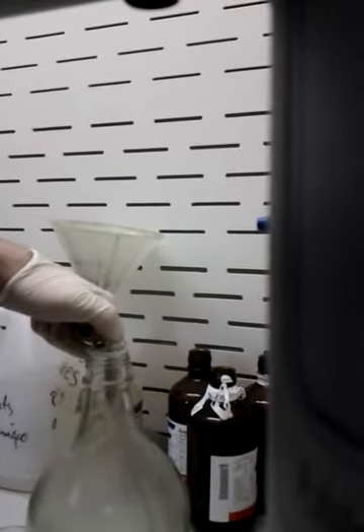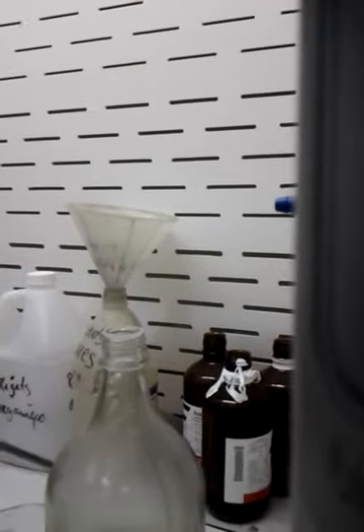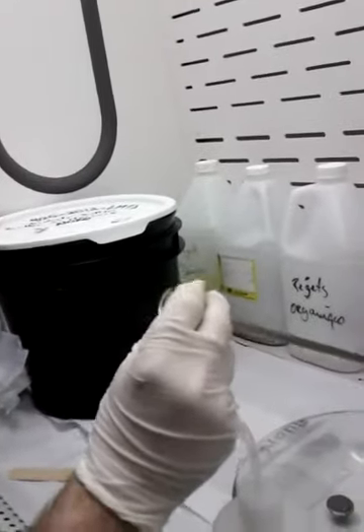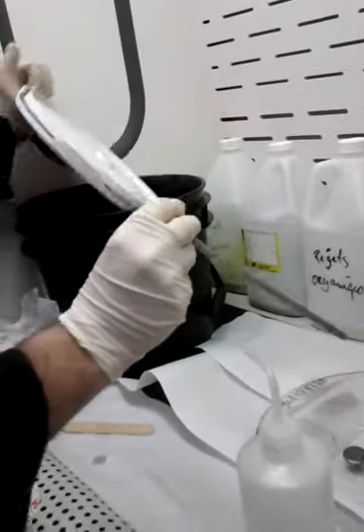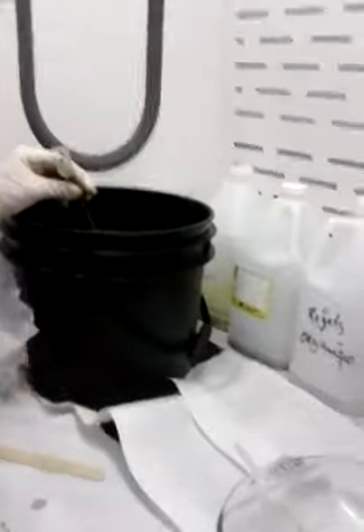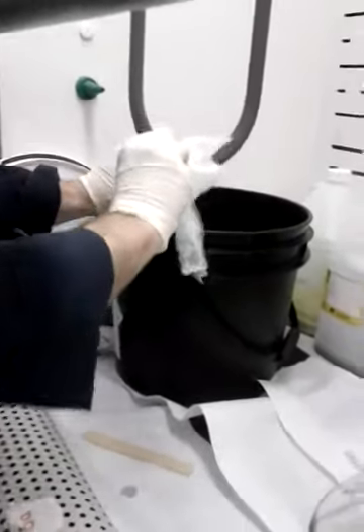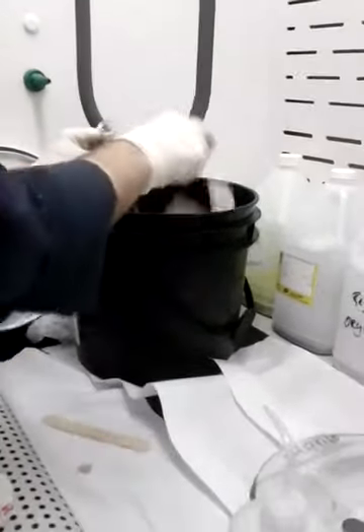My sample is very short, so it will be difficult. Like this, and the other part will be in the bucket. Usually there's a lot of mercury that remains here.